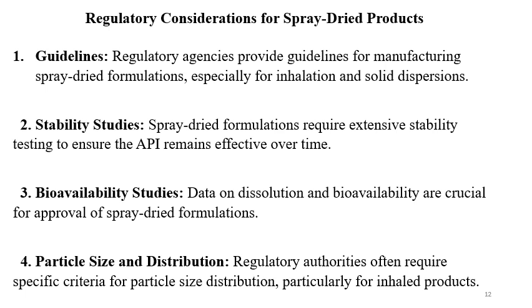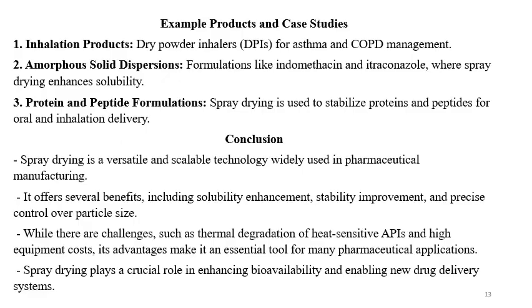If you are working on amorphous formulations by spray drying using the solid dispersion technology, then dissolution over the shelf life or expiry period is critical for the bioavailability. Particle size and distribution. Regulatory authorities often require specific criteria for particle size distribution, particularly for the inhalation type of formulations.